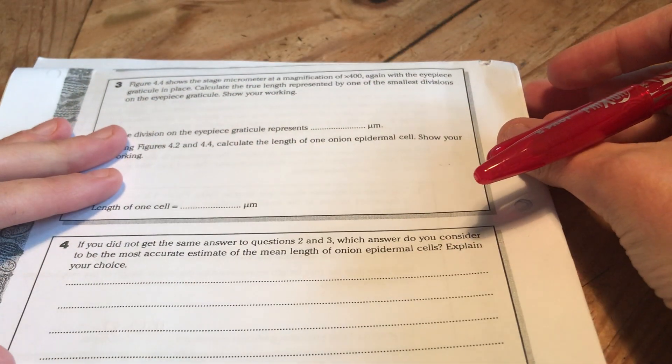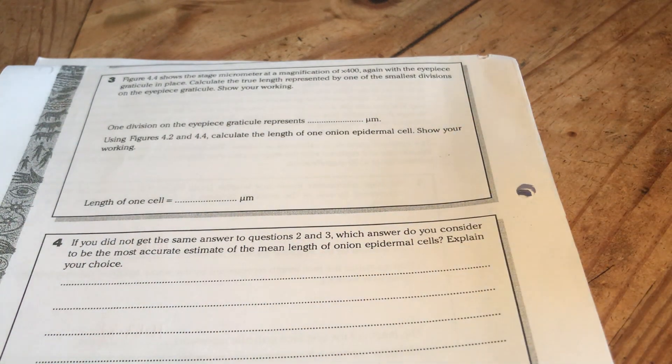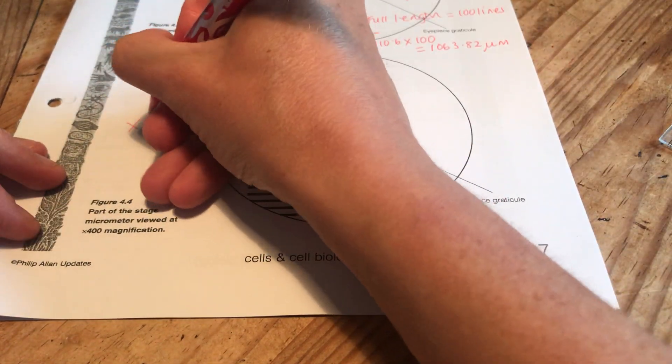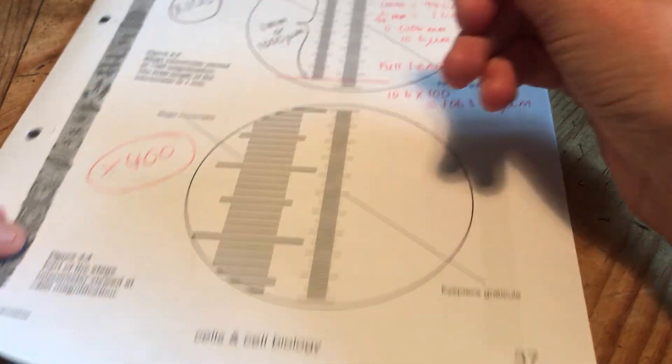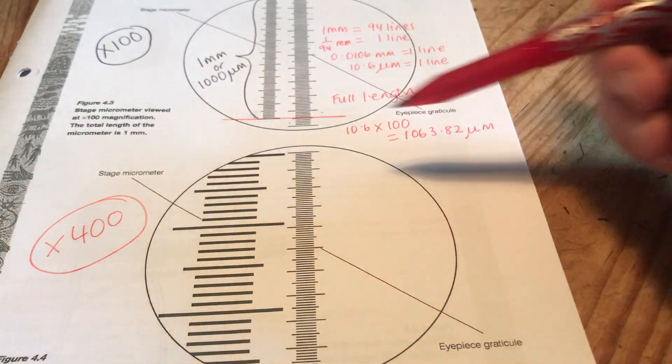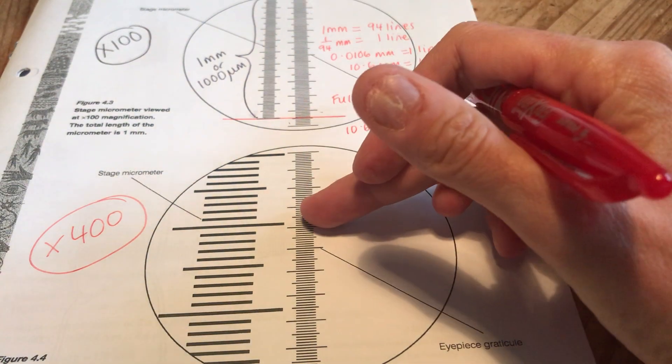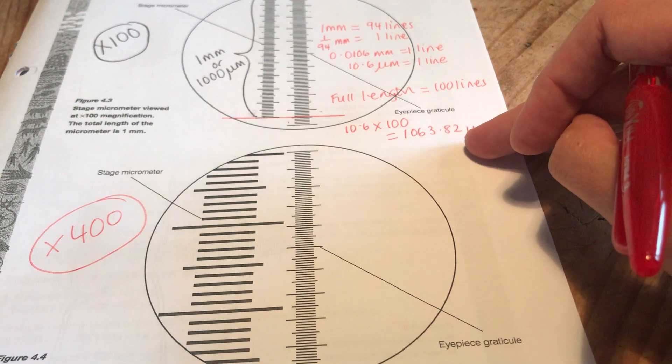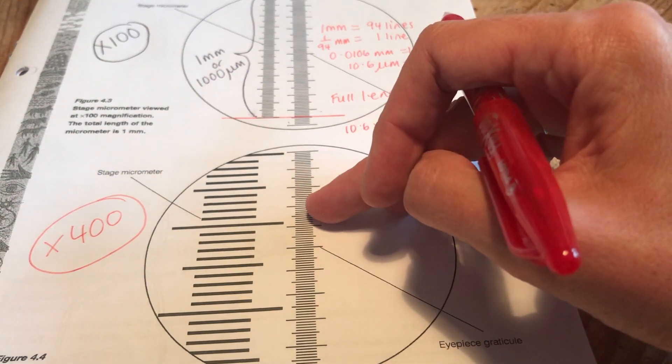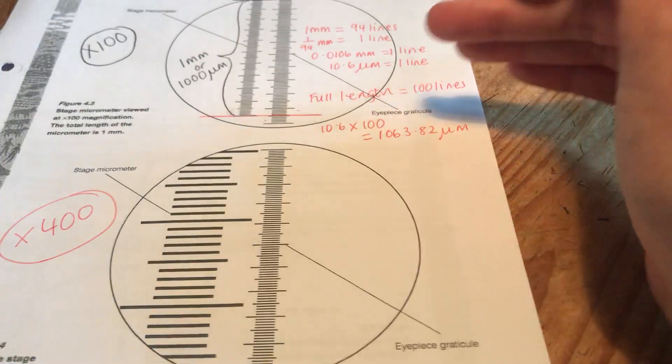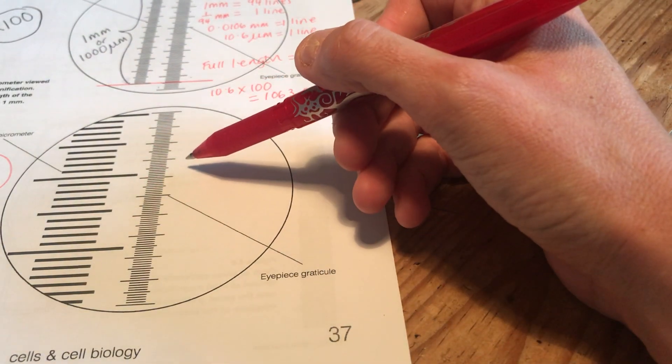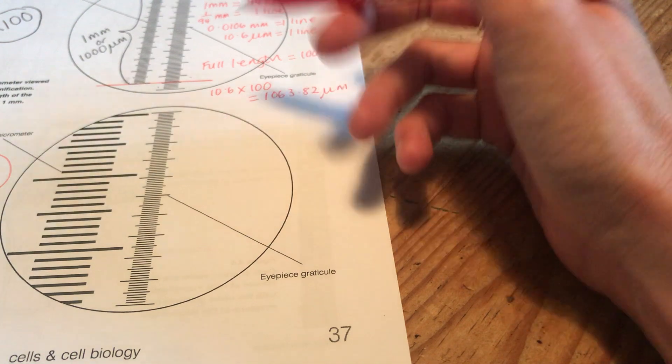Then question three. It says, figure 4.4 shows the stage micrometer at a magnification of times 400. So we've got bigger now. Let's find 4.4. There we go. So this, let's just put a little reminder, 400 times magnification this time. So even though my eyepiece graticule is the same length, now each line is worth a different distance on the stage micrometer. So I need to, we call this calibrating. We are recalibrating the eyepiece graticule on a different magnification. Let me read the question again. Calculate the true length represented by one of the smallest divisions on the eyepiece graticule. Show your working.